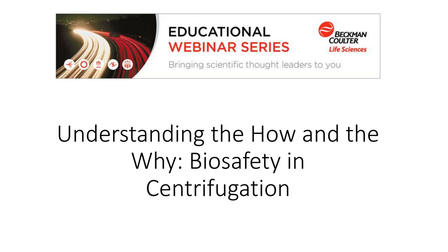All right, great, thank you. Our next question, what about pan balances for balancing? I'll start with that one. Personally, I'm not a fan of pan balances, but for centrifuges that are not ultra centrifuges, they're really fine. It's just in my experience, sometimes they stick a little, and I'm never 100% sure they're working the way they should. I don't know what it is.